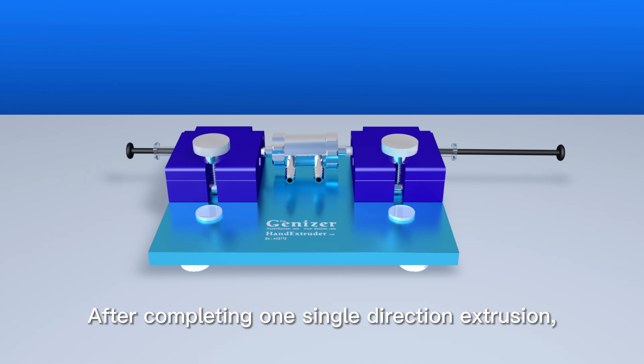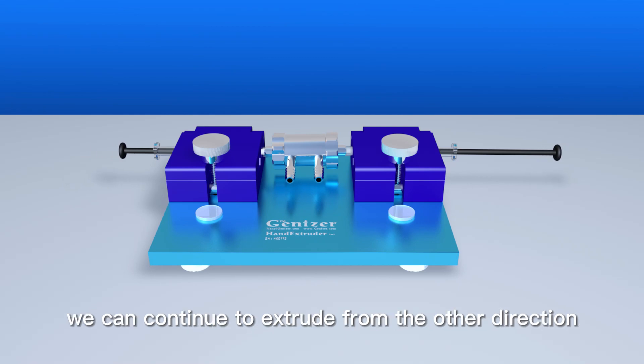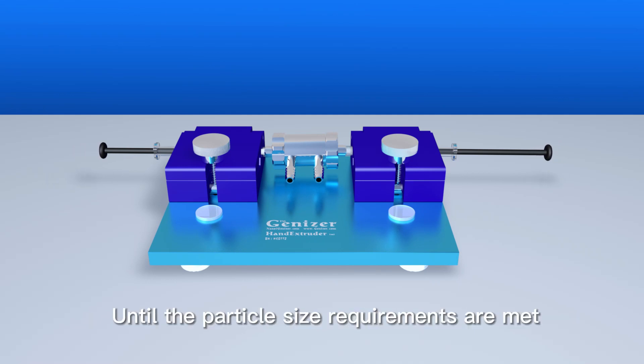After completing one single direction extrusion, we can continue to extrude from the other direction until the particle size requirements are met.